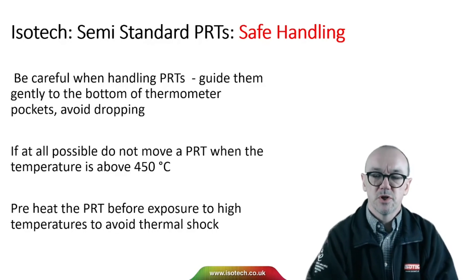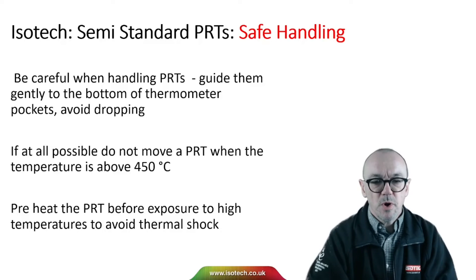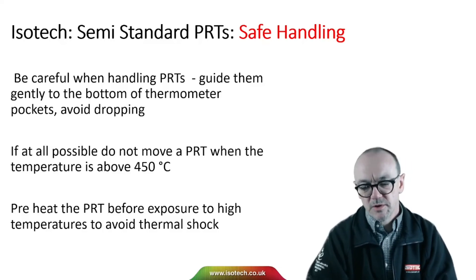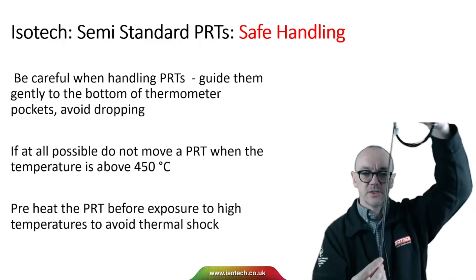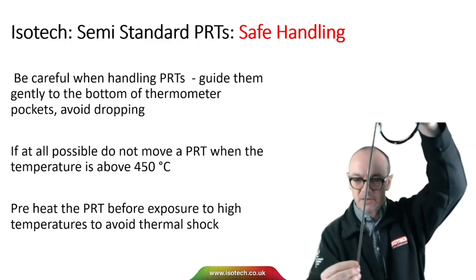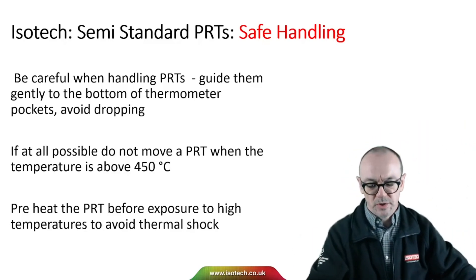Guide PRTs gently to the bottom of a thermometer pocket, avoid dropping them, and if at all possible do not move a PRT when the temperature is above 450 degrees C. It's best not to take a thermometer at room temperature and plunge it straight into a furnace at say 660 degrees. It would be better to preheat the thermometer and then lower it in gently, or to heat it more slowly to avoid thermal shock.